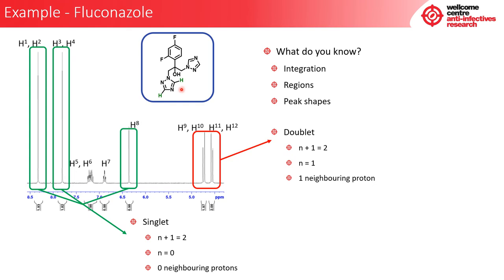However, I said you had to take everything into account. Now, an aromatic proton can only be one, in the sense that it integrates to one. And why is that? An aromatic carbon can only contain one hydrogen on it. So if we look at the integration here in the aromatic region, why do we see two protons? We're thinking, okay, there's two protons here, but I can only technically have one proton attached onto an aromatic carbon.